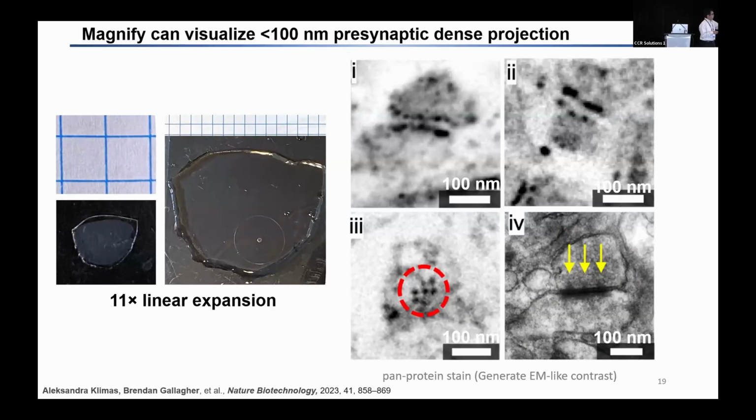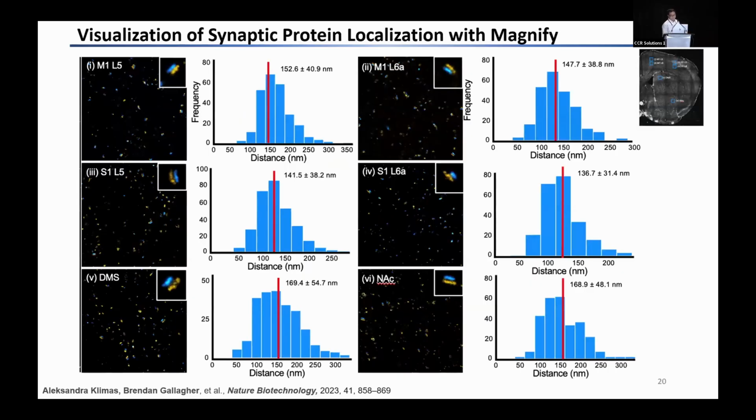Panels 1 and 2. And because confocal is 3D, you can apply a 3-dimensional view of the synapse and then rotate it. You can see the hexagonal structure that is very difficult to find if you're using EM. And of course, you can then use this resolution to measure the distance between the presynaptic protein and the postsynaptic protein, and then measure the distribution of those protein distances in different brain regions.